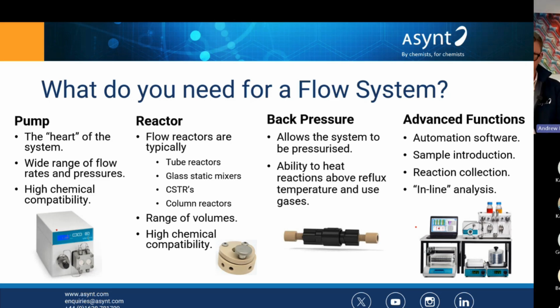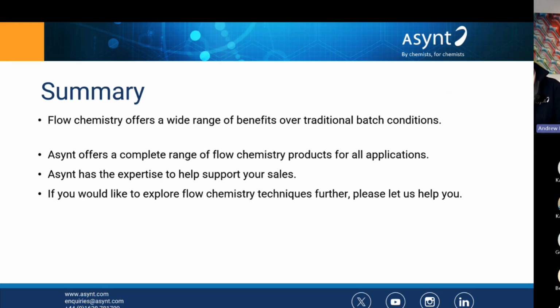So I'm going to finish there, and just to summarize, flow chemistry is a useful technique. It's a really useful tool that can give us a number of benefits over traditional batch methods.